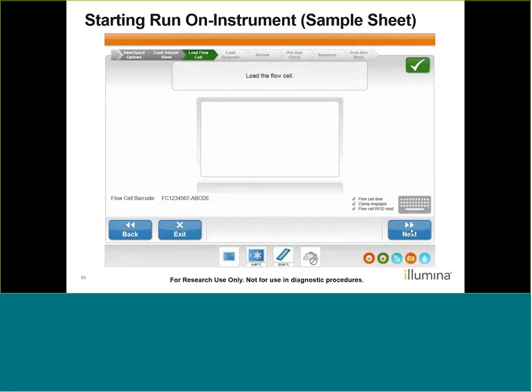Now, one thing you may run into, just as a note, is if you have older sample sheets that you're used to using with MCS2, the validation with MCS3 is much stricter. So sample sheets that may have passed the previous validation may not pass this validation. And that has to do with things like making sure all your analysis settings are correct, making sure there are no extra lines or extra spaces. We do recommend, if you're going to use IEM for sample sheet mode, update to the latest version of IEM. If you do run into problems, you can always import your sample sheet into LRM and set up your run through that mode and fix any errors that it flags.